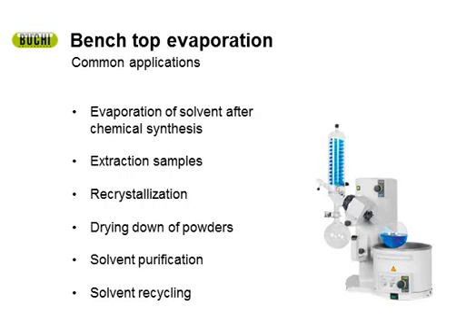And the last two are getting bigger and bigger in this field because the scientific industry is trying to go more green: solvent purification and solvent recycling. What this allows you to do is recover your solvent. You can purify it so you don't keep using new solvent. You can reuse the solvent that you already used once, save money doing so, and you can save the environment by reusing the solvent and not just disposing of it.